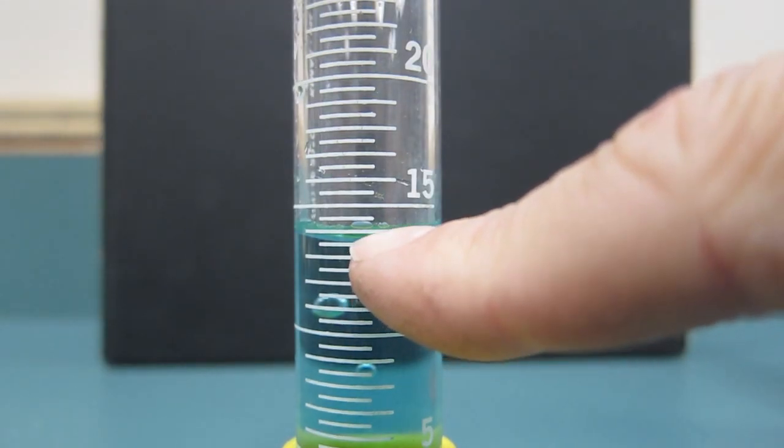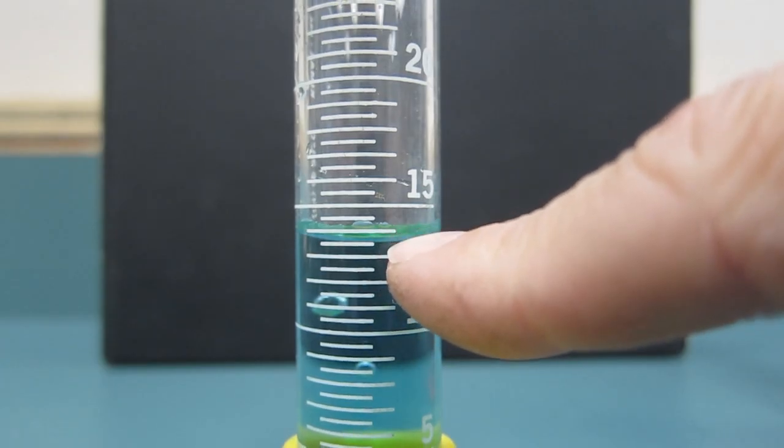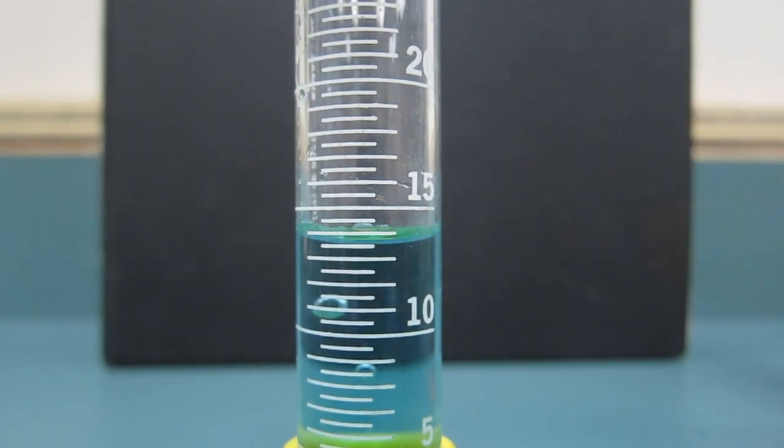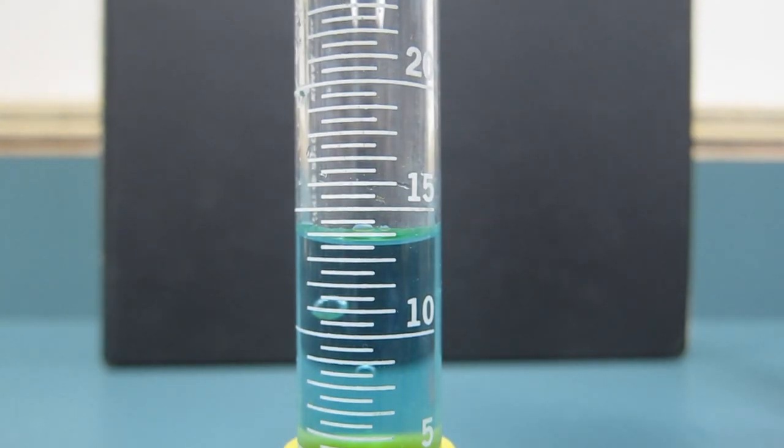Even though the water level comes up to that tick mark right here, I'm not reading from this one. I'm reading from the one below because that's the bottom of the meniscus. And then finally, the ones that we don't use quite as often in here are these two graduated cylinders.